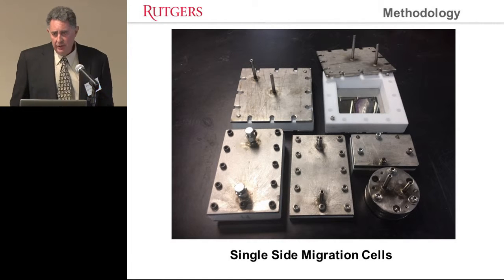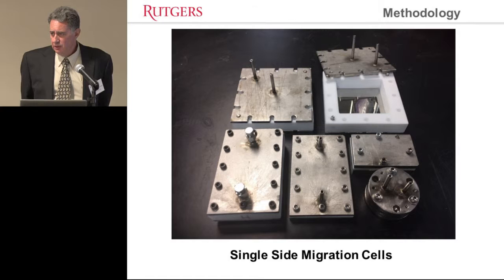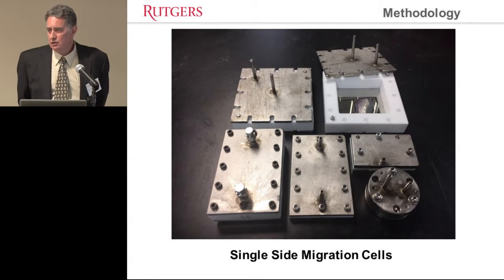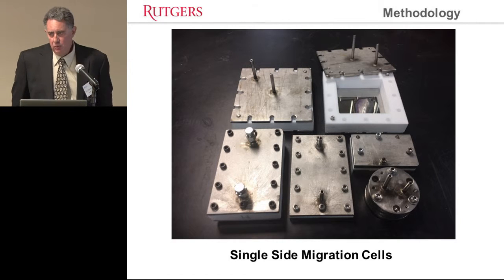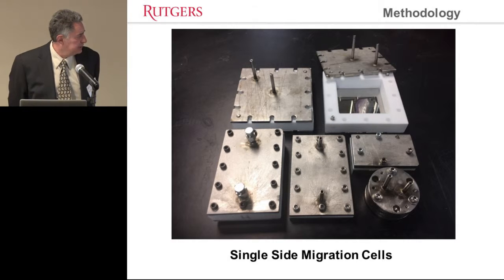They're made out of Teflon gaskets and stainless steel plates with filling ports in the top to fill and empty the cells. The gaskets in the middle vary in size so that we could create any solvent volume to surface area ratio that we need. The most common is 10 mLs per square inch. You'll see here's one with no filling ports. That's one that I would use for MPPO, or the solid food simulant. Since it's not a liquid, you don't have to worry about filling it up.